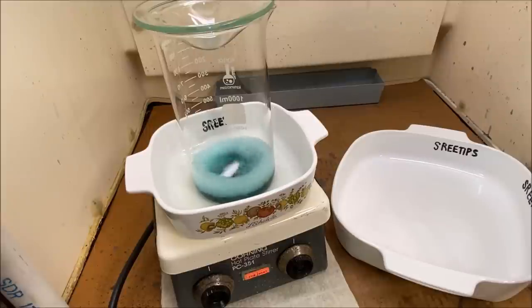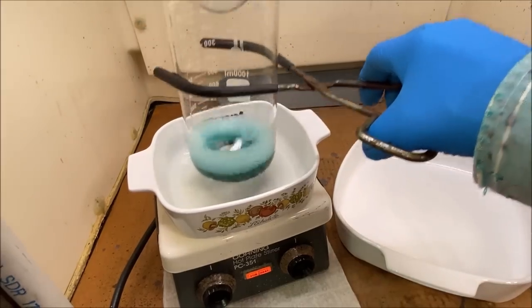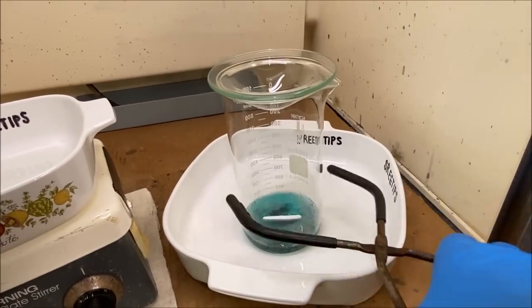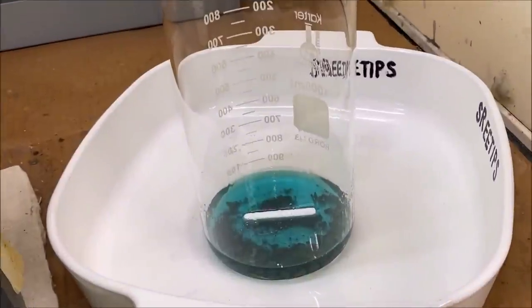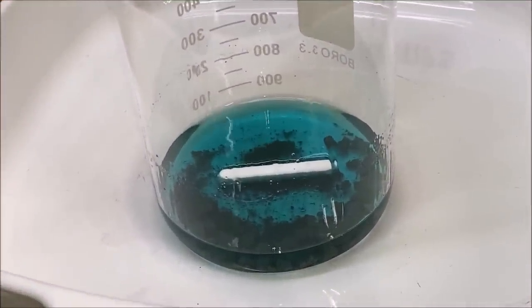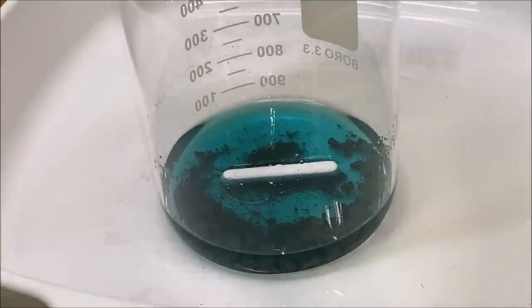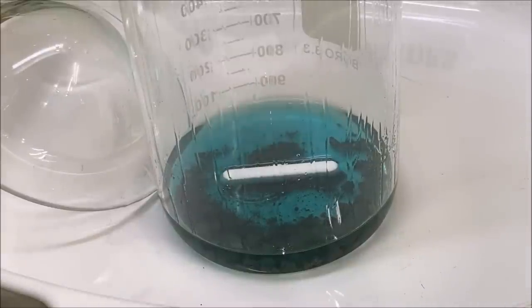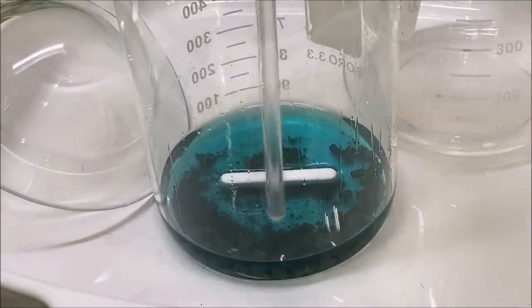This has been on boiling and dilute nitric now for probably an hour. Let's pull this down. I think I made a critical error in that I didn't crush that material up before I started this. It's still kind of clumped together in there. I am getting a fairly positive result here in that we're pulling copper out of there, which is a good thing. We don't want any copper in with our precious metals.